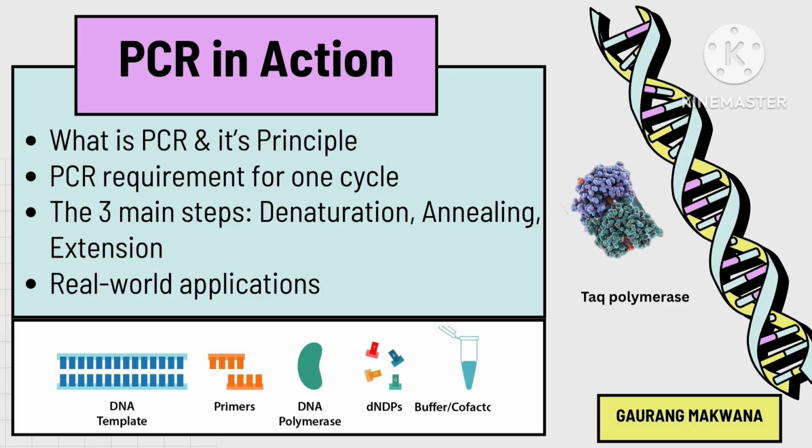And in this video lecture, we are going to discuss PCR, the DNA copy machine. Imagine needing just one page from a book, but making millions of copies in a minute. That's what polymerase chain reaction does for DNA.